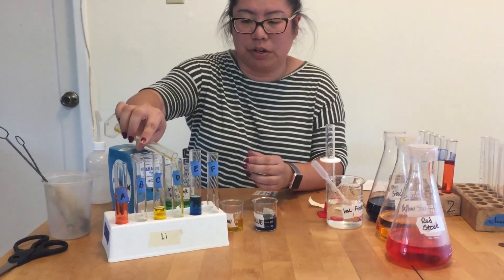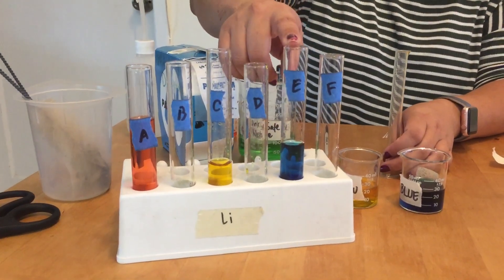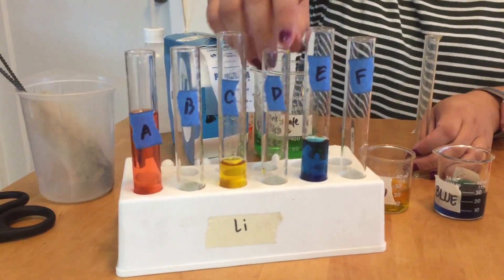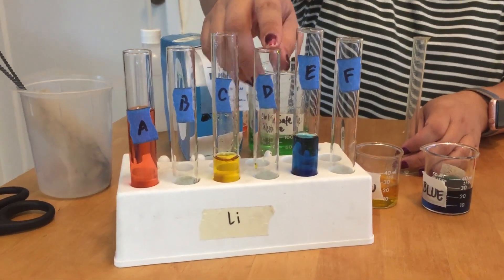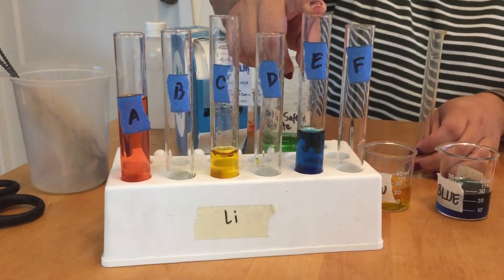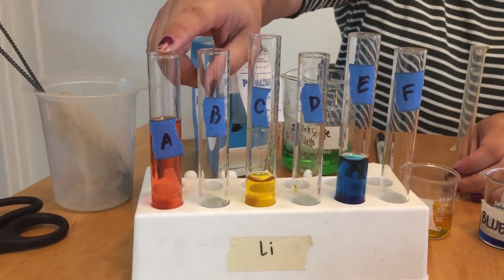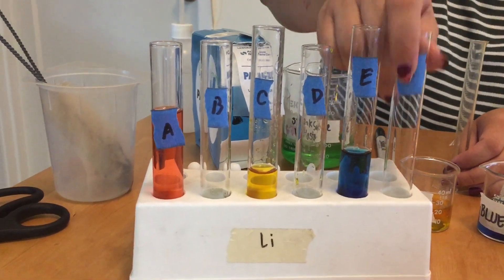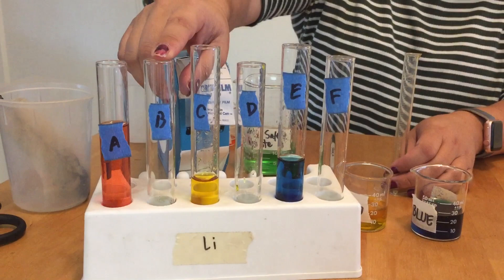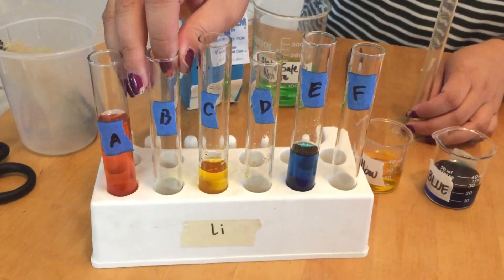Step 8: take 7 mils from tube E and put it into tube D, then swirl. Step 9: take 4 mils from tube D and put it into tube F. Step 10: take 7 mils from tube A and put it into tube F, then swirl. Step 11: take 8 mils from tube A and put it into tube B. Step 12: take 3 mils from tube C and put it into tube B, then swirl.